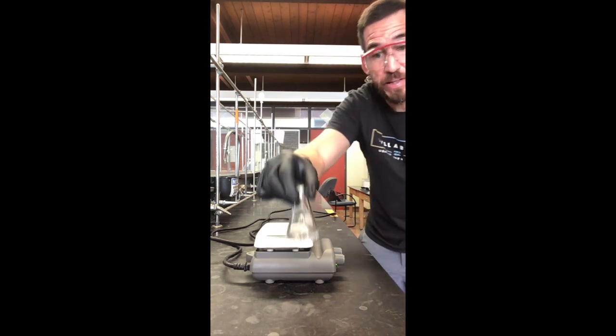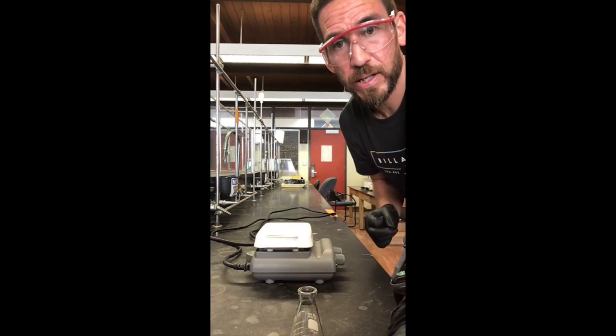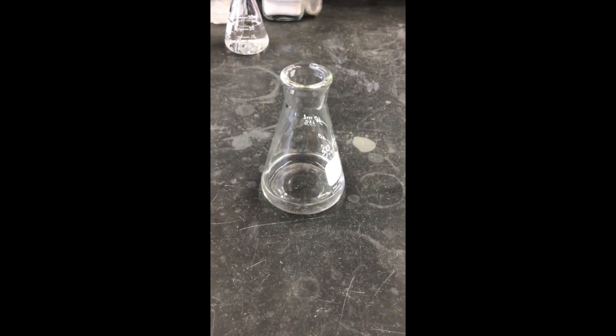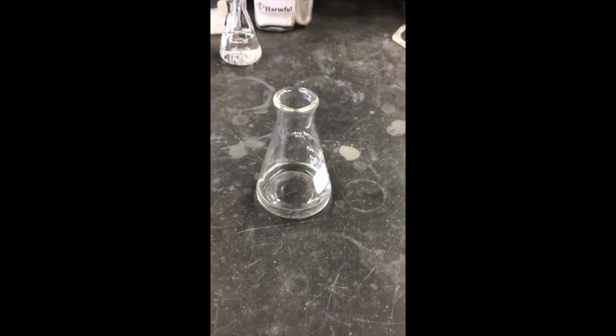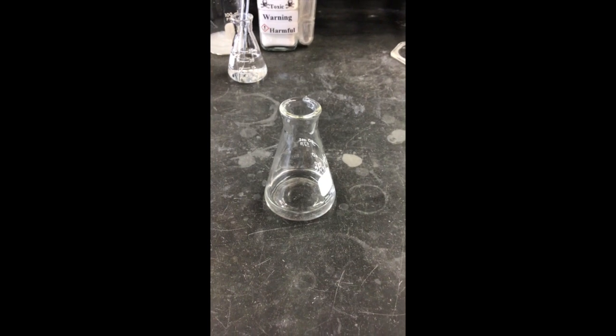So now I can place it on the bench top and let that cool to room temperature, and I'll give you a look at it right now. All right, so here it is, looking good. So again, basically you can cover this if you want, or I would just put it somewhere safe, depending on what it is. You don't want your lab mate to knock it over. You don't want to hate yourself or your lab mate, because that's not cool. Nothing but love, right? But if you let it sit here, cool down to room temperature, nothing happens.